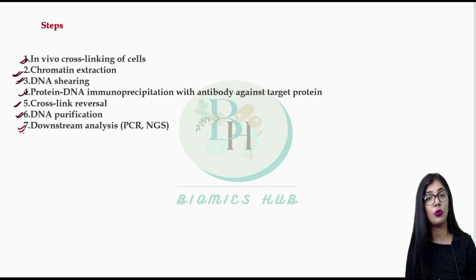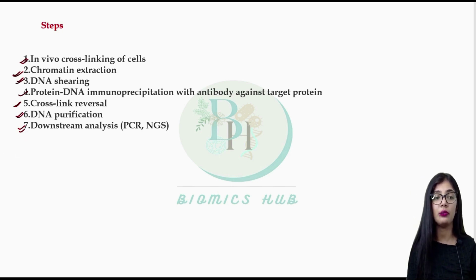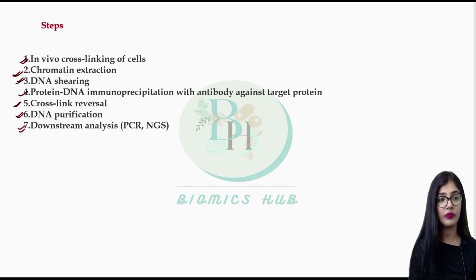sequencing. Suppose we know that this part of the DNA is interacting with the protein. Now we have to find out what the sequence of the DNA is. So for that we perform the NGS. So let us see the details about these steps one by one.